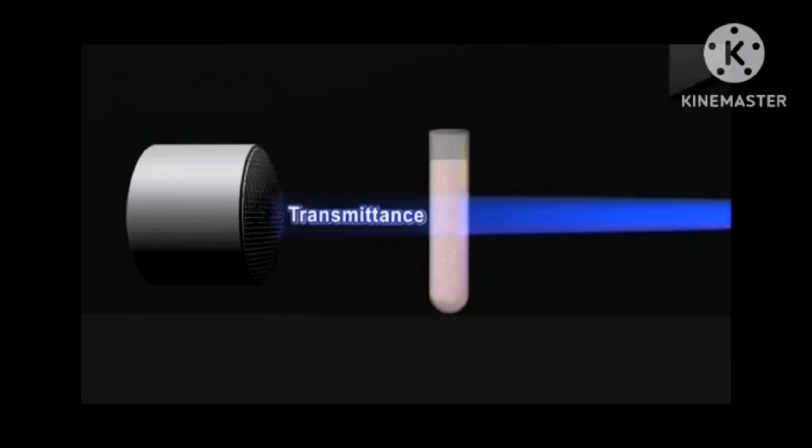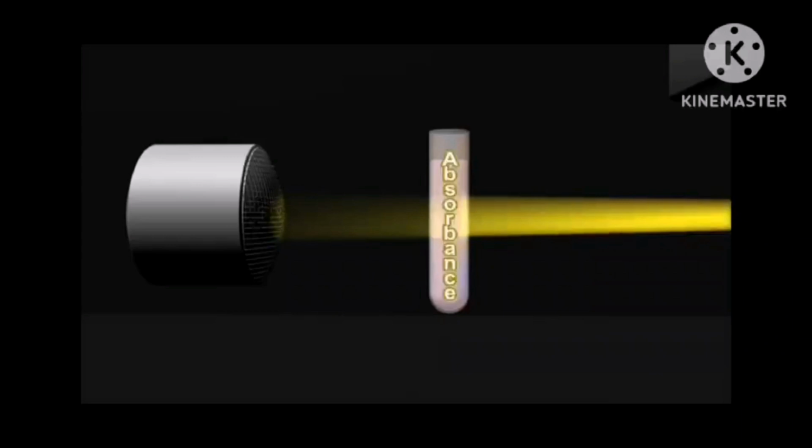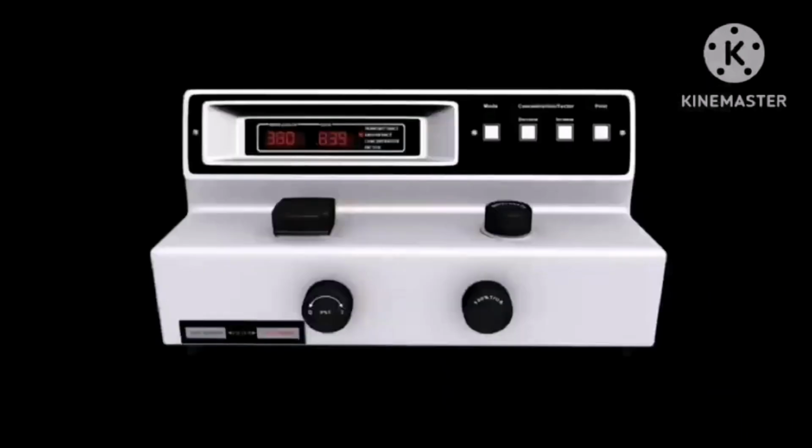Transmittance refers to the amount of light that passes completely through the sample and strikes the detector, while absorbance is a measurement of light that is absorbed by the sample. The detector senses the light being transmitted through the sample and converts this information into a digital display.